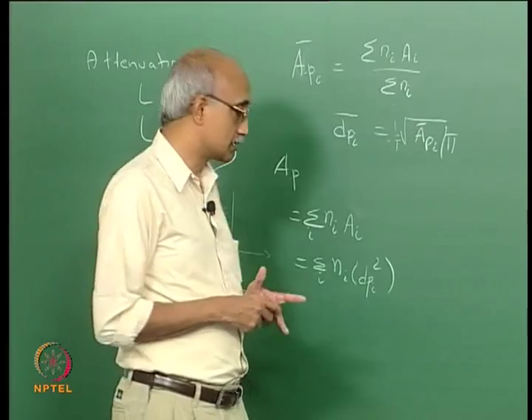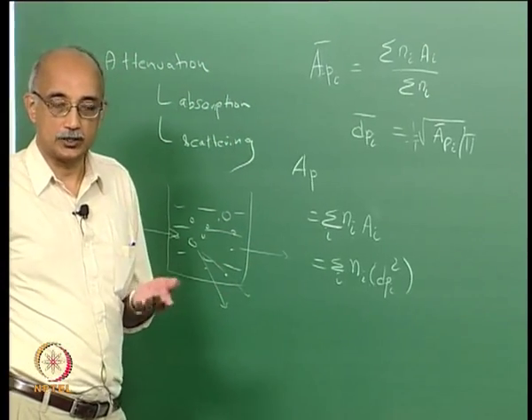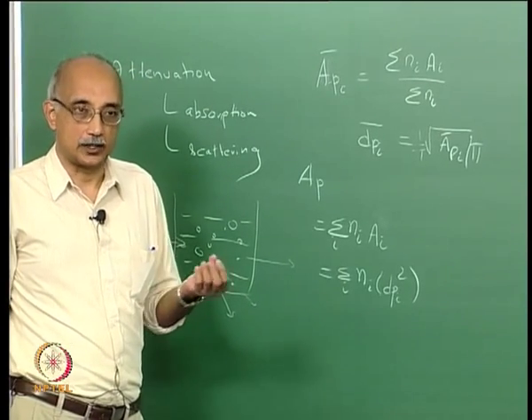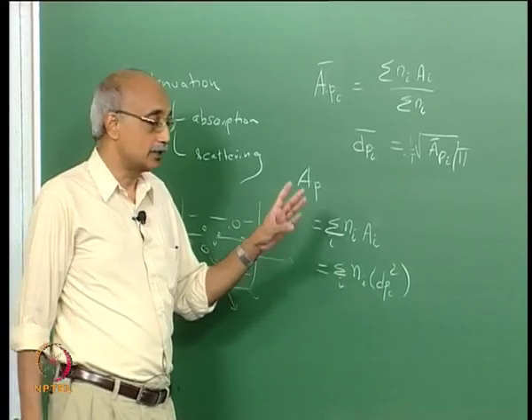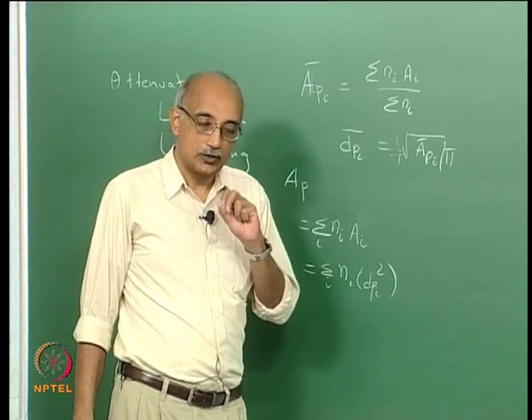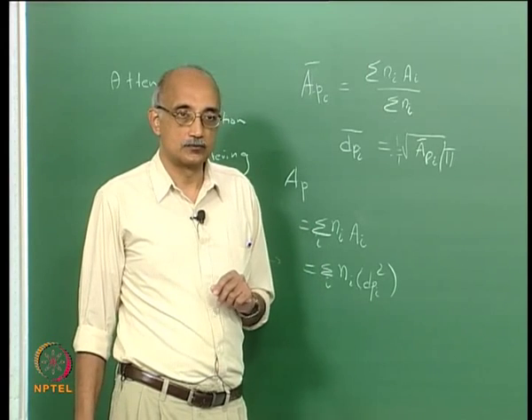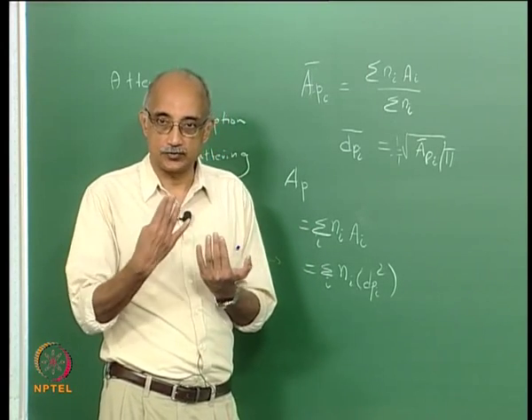Now the difference is, an instrument that is used to do this measurement, for example a turbidimeter, probably costs about 1 lakh, whereas an instrument that is used to do single particle size analysis using light scattering, even if you are restricting your lower limit to about 1 micron, still costs about 15 lakhs. So there is about a 15x differential.